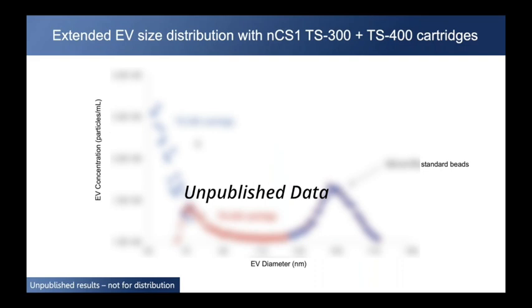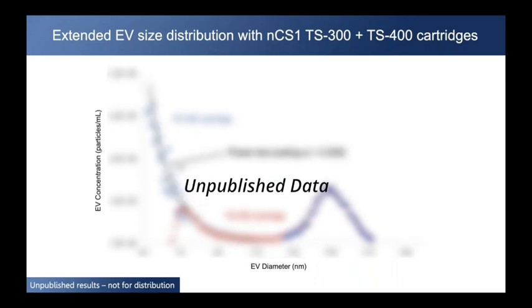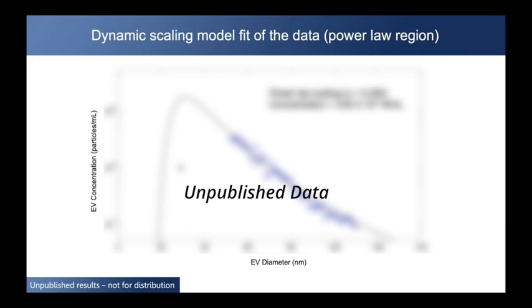To get the particle number concentration, then we have to extend that TS400 cartridge measurement down to lower diameters using the TS300 cartridge measurements, as I showed in that figure inset. That extrapolation follows quite well a power law distribution. And in fact, then we can model fit these results with that power law distribution. These are fit to the overlapping data of the TS300 and the TS400. It shows a maximum of around 30 to 35 nanometers in the distribution and a minimum diameter of around 20 nanometers. And you can see from this plot that the area under the curve here is very important, and accurate estimates of that area are essential to get good number concentrations.